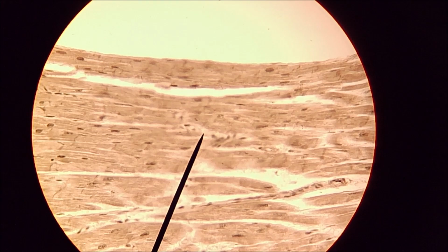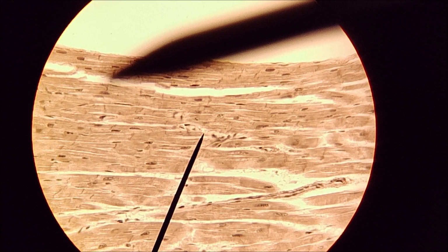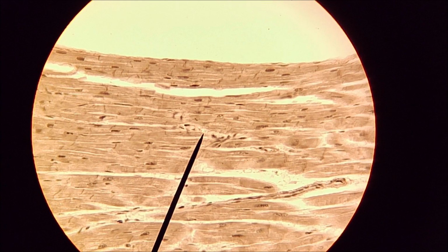But what I really want to point out to you are the intercalated discs. Now, it'll probably be better on an image, but there's one. Can you see there and there? All these little lines through here? These are intercalated discs. There's one there. All right, so those are intercalated discs. Those are going to be with gap junctions in between the uninucleated cells.